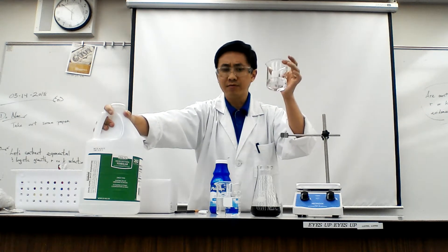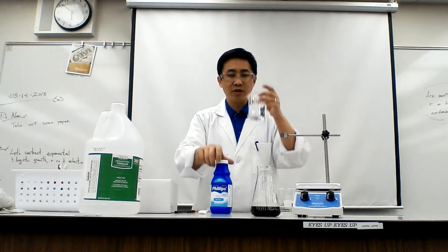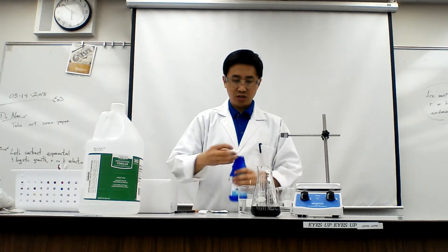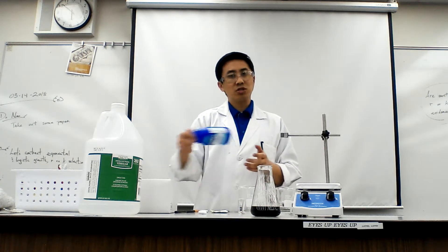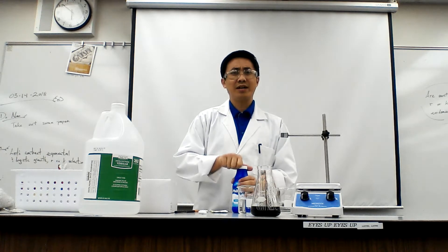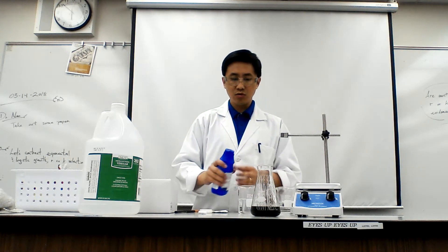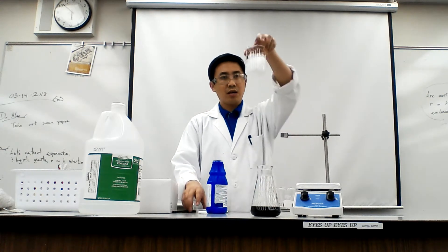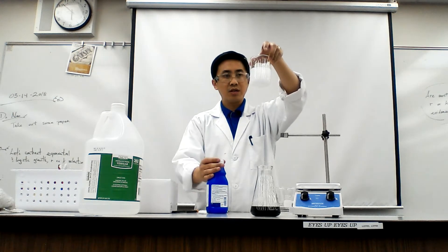I've already poured myself around maybe 70 mils of vinegar, and this is more than enough. Here's what you do: start by grabbing your water, around 125 to 150 mils, and then put in a splash of the milk of magnesia. Be very careful — you've got to shake it up a little bit. It's a suspension, so eventually it does settle to the bottom. You don't need a lot of it; the more you put in, the more acid you're going to need to neutralize it. I'm going to put in a splash — just a splash, that's all you need.